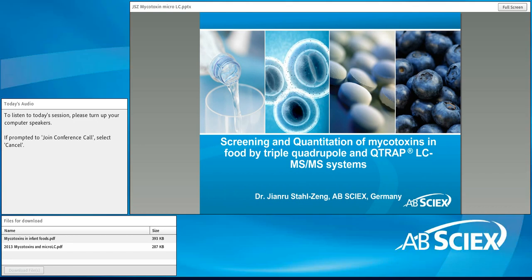Join today's webinar. In the first part of the webinar, I would like to talk about screening and quantitation of mycotoxins in food by triple quadrupole and also QTRAP LC-MS instrument.